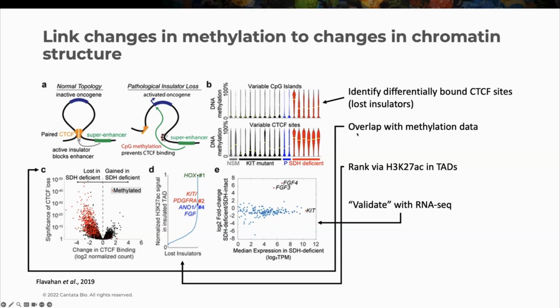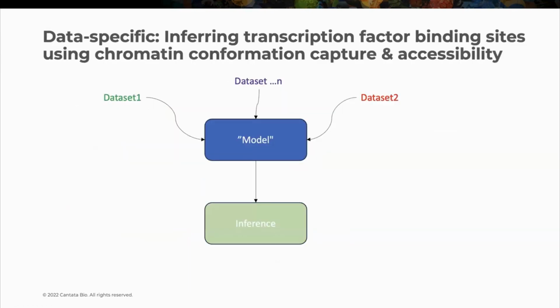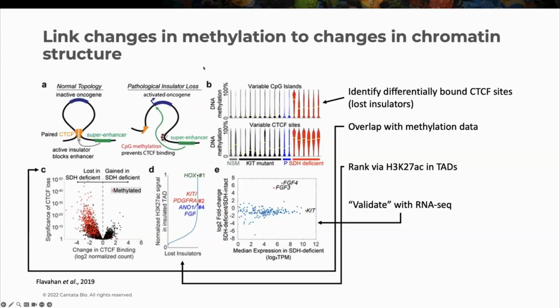So you can see how this strategy really takes a lot of information. This can be potentially hundreds of thousands of CpG islands, and it's shortlisted to a number of genes that potentially influence our experiment. All right, so that's an example of a comparative analysis.